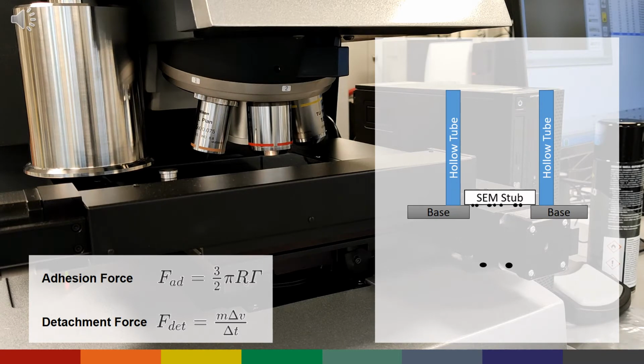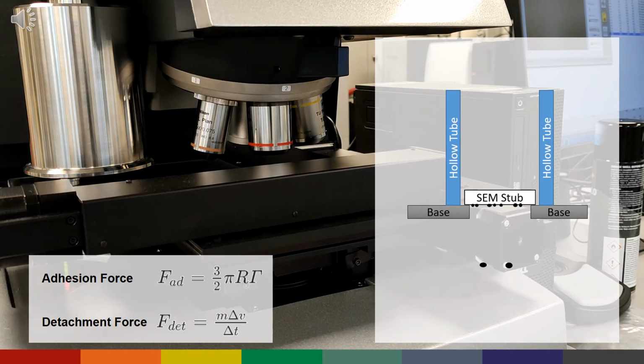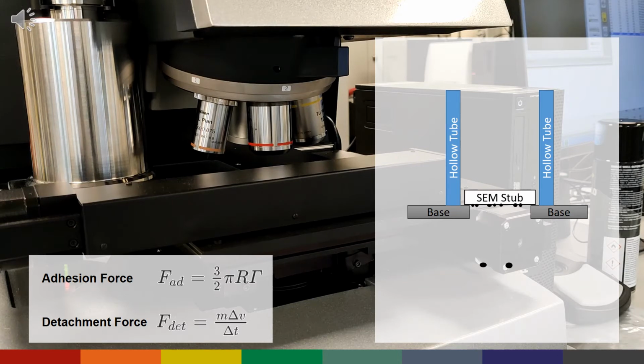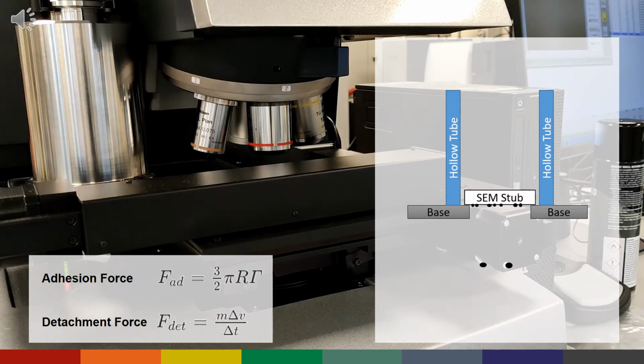At the instant of impact, the SEM stub experiences a short period of deceleration, and that generates a tensile force between the particles and the surface of the stub. The competition between the force of adhesion and force of detachment will decide which particle survives the impact. The adhesion force is calculated based on the Johnson-Kendall-Roberts theory, while the detachment force is based on momentum.